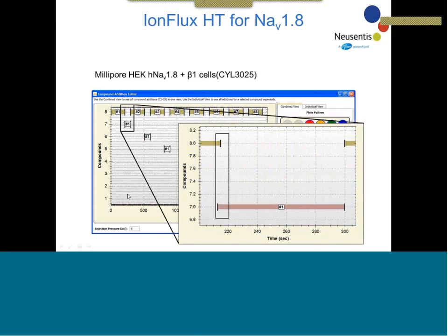And again, we're overlapping the liquid applications so that we get instantaneous change of the liquid. In our case, this change takes place in between the measured sweeps. Therefore, the first sweep of your compound application should already show the block beginning. You don't have to do it this way, but we found it to be quite useful in order to speed up experiments a little bit.